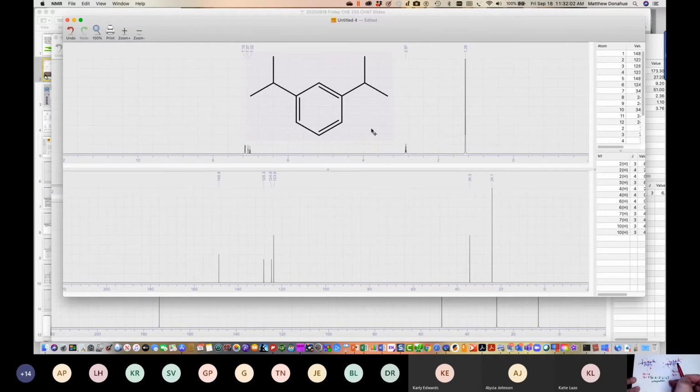So again, that's right. Could you mark the unique H's? So yeah, the unique hydrogens. So I'll put some marks: the 1s, those are methyl groups.